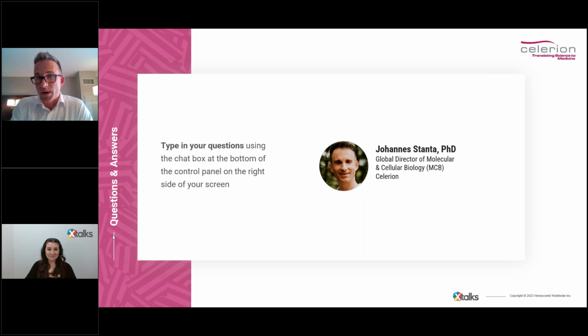We've also found during the stability assessment, and the freeze-thaw assessments in particular, that you can potentially see differences in recovery after you've done the freeze-thaw, but they're not genuine, they're artifacts. A lot of them we found were due to how you spike your reference material into it and what matrix you use to spike into, rather than a genuine loss of stability of your viral genomic DNA, which we cover in validation. However, it's very well known that the stability of these samples should be given, and shouldn't be a concern. So if you run into stability problems or freeze-thaw problems, it's probably to do with the experiment rather than a genuine problem.